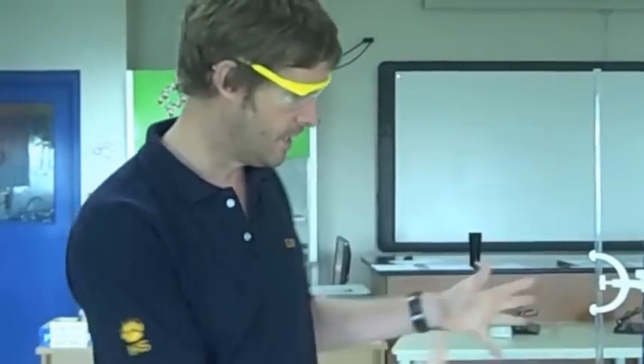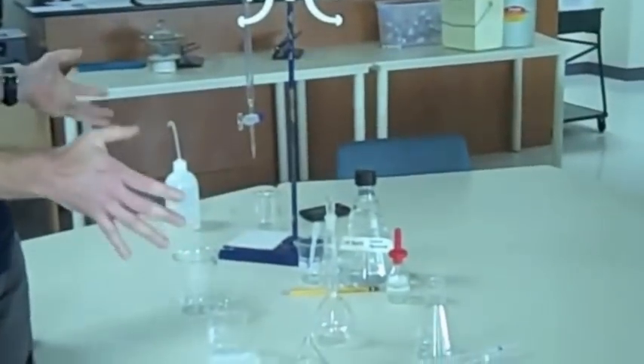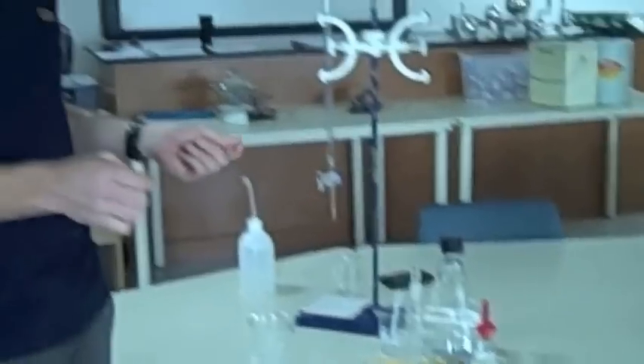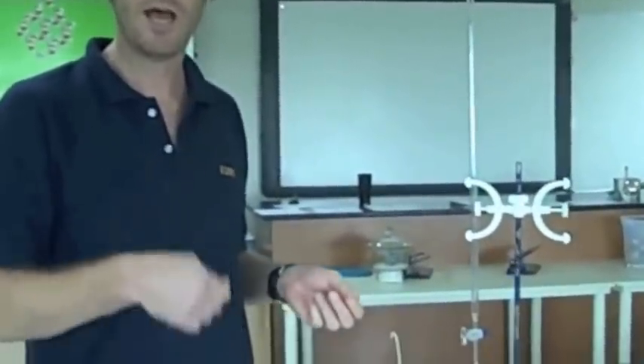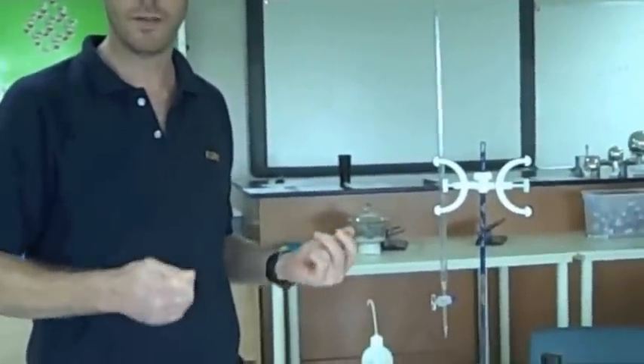Hello everybody. Well here we are. I'm going to give you a brief introduction on how to carry out a titration, because it might be the first time you've used any of these apparatus — the kind of apparatus here which is really specific: volumetric apparatus for measuring accurate and precise volumes of liquids.